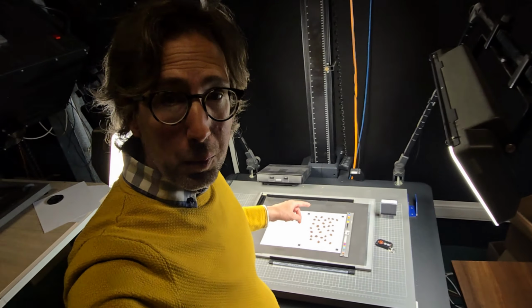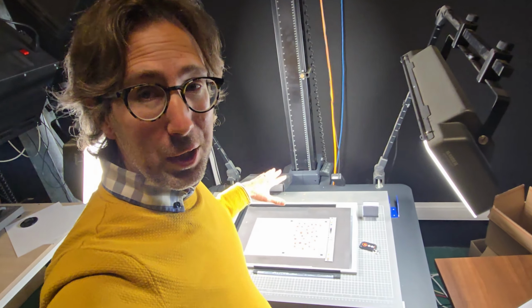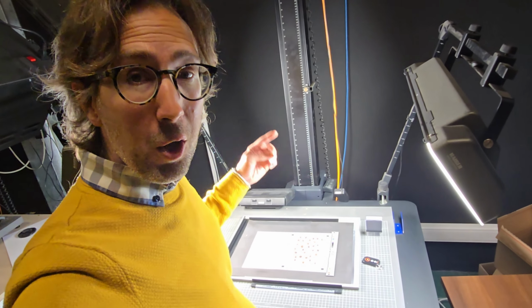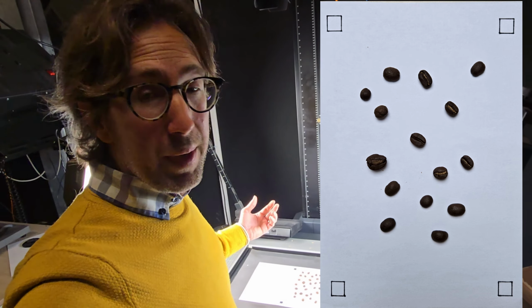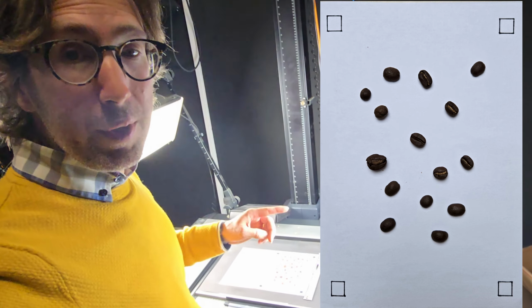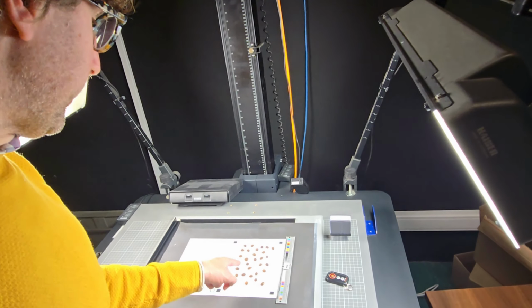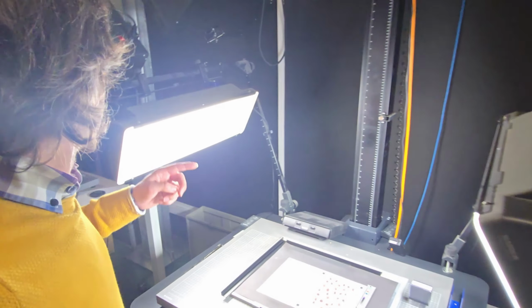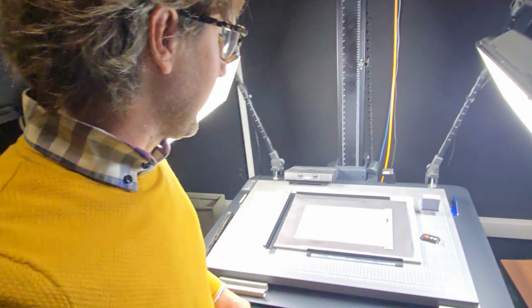As I wasn't actually aware that I was going to be able to make a picture here, I actually made this sheet so I can just make a picture with my cell phone, but the one that I was making in my office had very poor light conditions, so I ended up here with these near perfect. You can still see some shades, so you could always get better light, I guess. They actually have these bigger setups, I guess, to do exactly this.